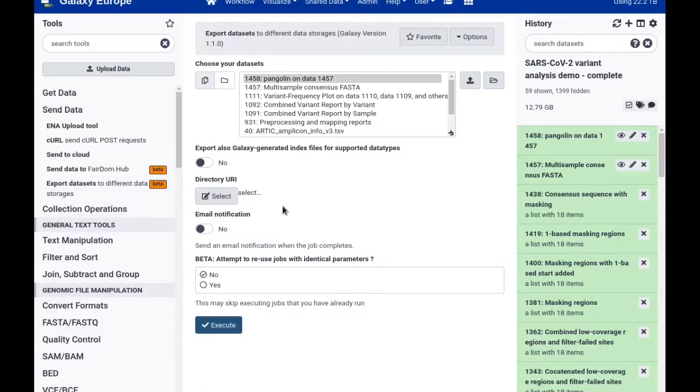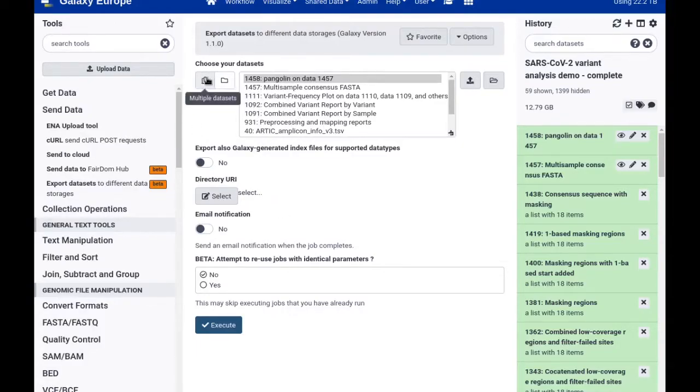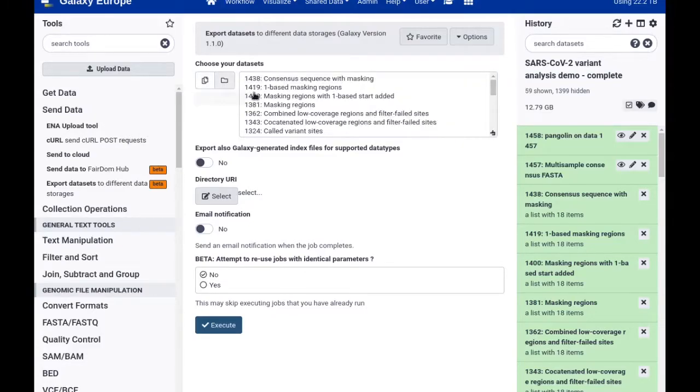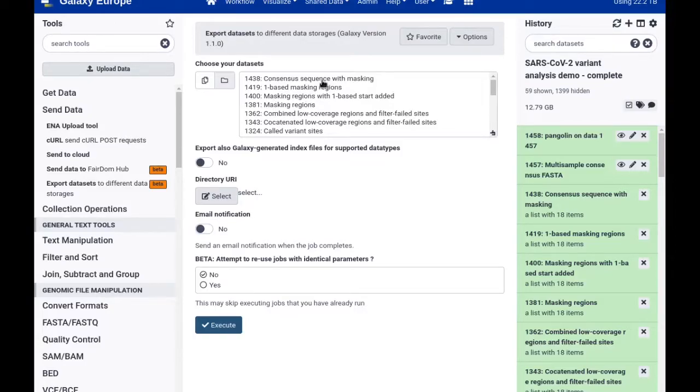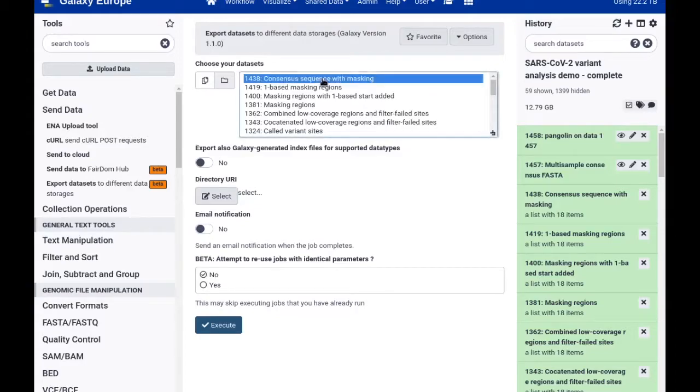You can now select datasets you'd like to export, which can either be regular datasets or collections. So I will again choose here my collection of FASTA files from before.